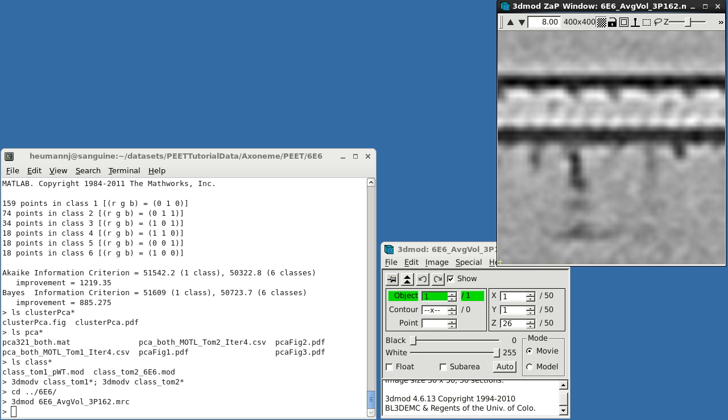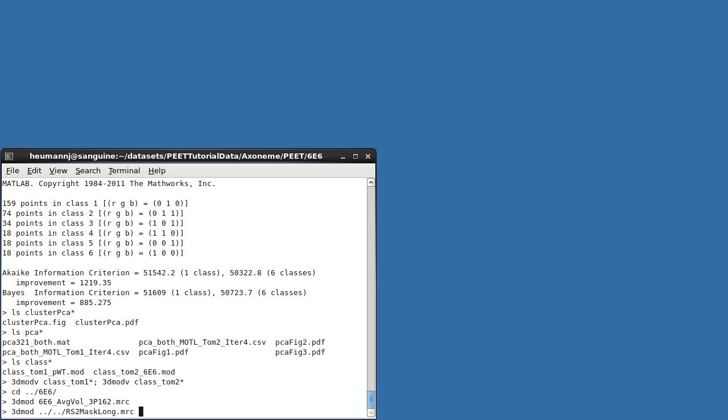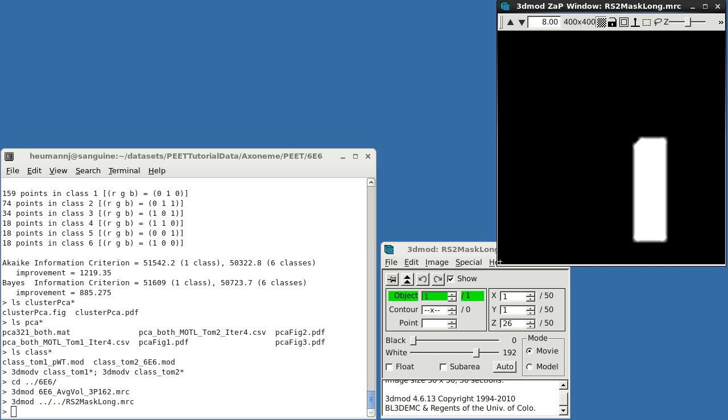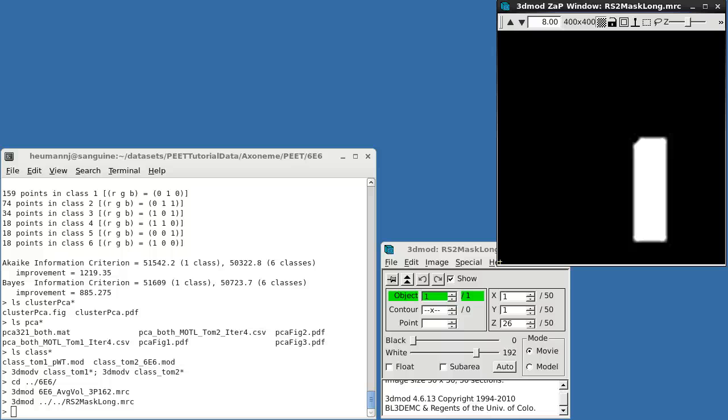Now consider characterization of the 6E6 data alone. Recall that Radial Spoke 2 was only faintly visible in this average. Let's investigate the source of this variability. Tom Heuser has created a binary mask for the Radial Spoke 2 region. 1s are placed in the region of interest and 0s elsewhere. Tools for creating custom binary masks such as this are not supplied with PEAT. You can generate such masks visually in IMOD by drawing contours around the desired region and then running program IMOD-MOP. You can also specify them algebraically in MATLAB or in other languages.